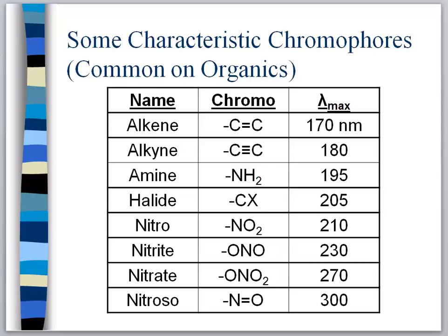Okay, so there's a lot of stuff that goes on here, right? You know, colors and the different colors and the complement colors and the proper regions of where I should be measuring these colors. And now we get this UV portion, and the UV portion has nothing to do with color at all that I can see. But I'm told that these molecules are probably absorbing in the UV region. I mean, there's a lot of stuff that's happening, and there's a lot of stuff to keep track of.